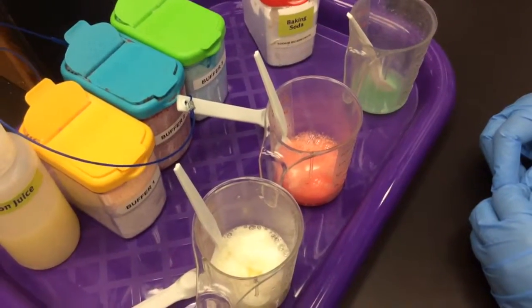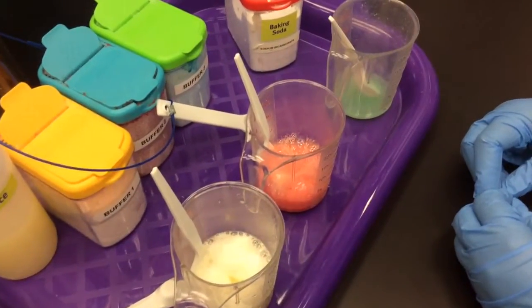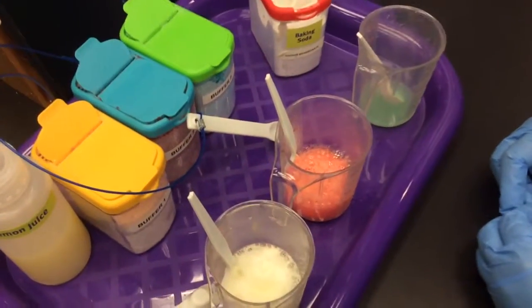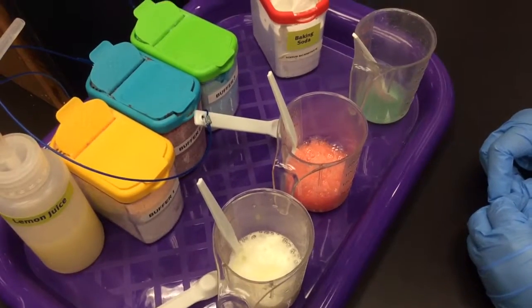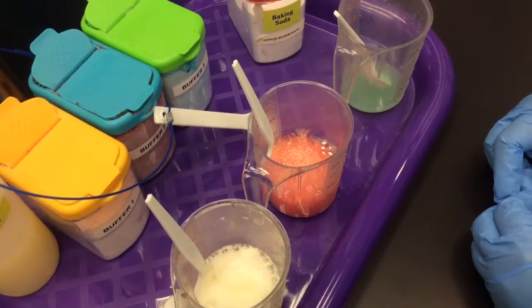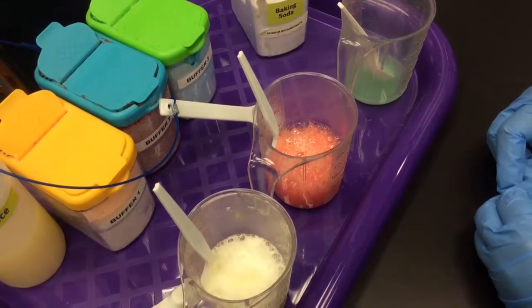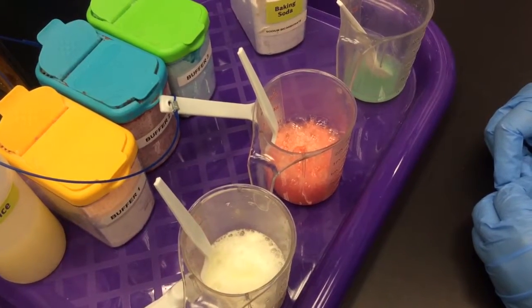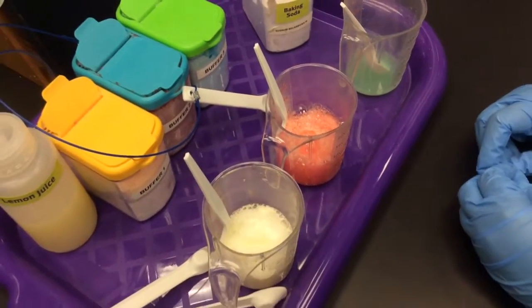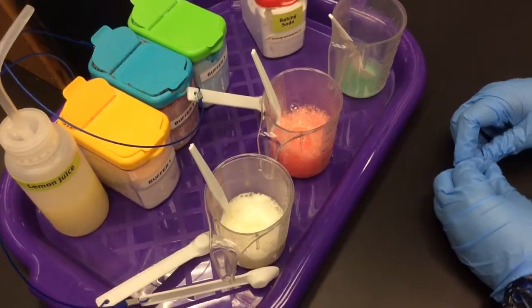What do we notice about this one, Selena? It's much slower than the first one. Okay, so we notice that this one is occurring pretty slow. The bubbles seem to form pretty fast though. Yeah. And we can see that the bubbles seem to be popping a lot. So we see that it's producing a high amount of CO2.